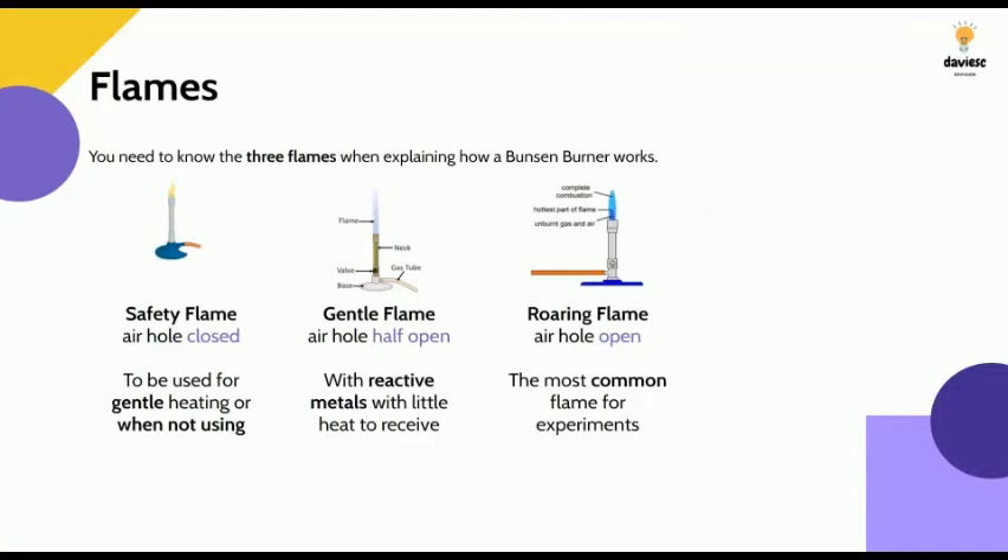The three types of flame you need to know are the safety flame, gentle flame, and roaring flame. For the safety flame, the air hole is fully closed; this is used when you're not using it or gently heating a chemical. For a gentle flame, the air hole is half open, used for more reactive metals which only need a little heat. For a roaring flame, the air hole is fully open, and this is the most common flame used for experiments.